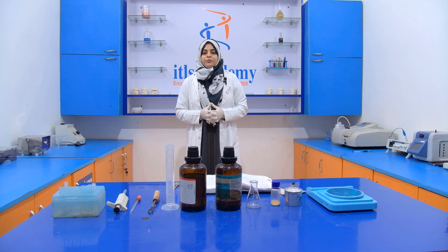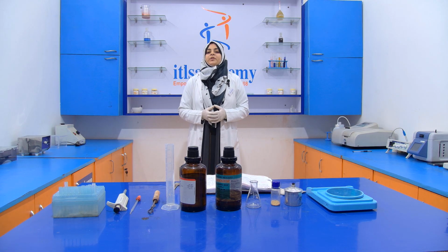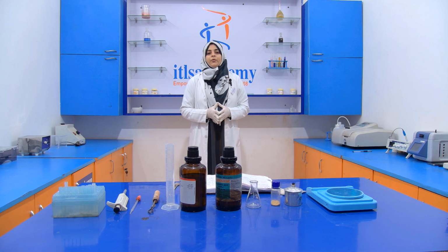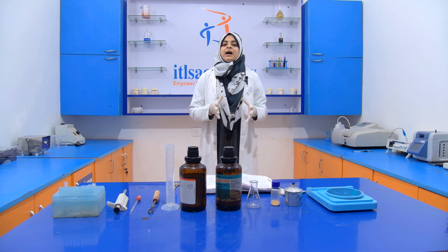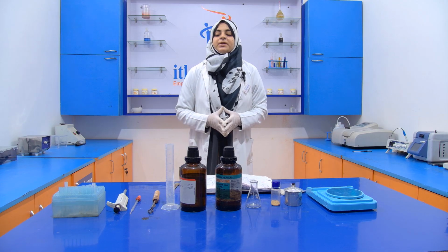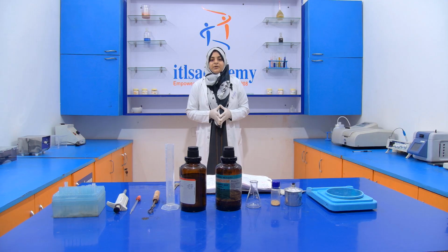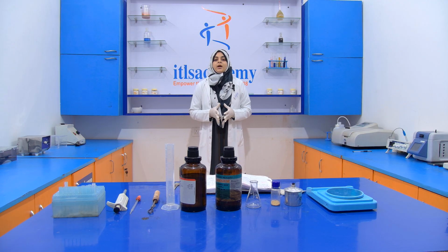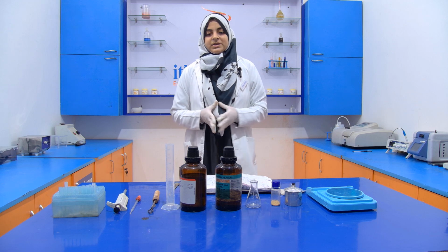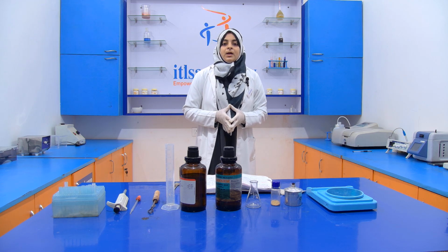Today we are going to discuss another experiment in the series of food adulteration, and the experiment that we are going to perform today is the detection of colophony residue in asafoetida. Here the adulterant is colophony residue, and the food sample is asafoetida.